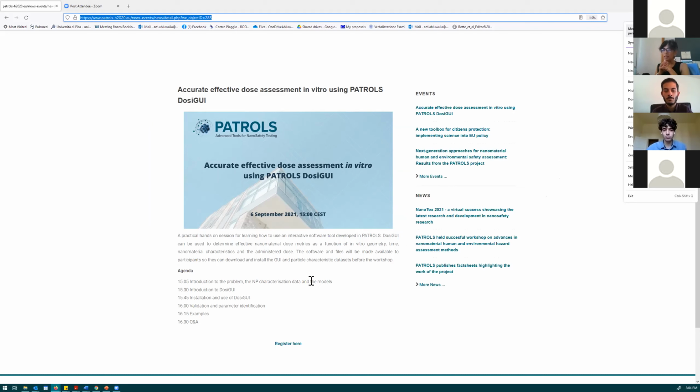We'll show you a couple of examples as we go along, and then at the end of this session, we can discuss some of the problems you might have, and also some of the improvements one might want to include in this tool. So hopefully it'll be very interactive, and if you do need to say something, ask questions, please feel free to do so. Don't feel as if you're interrupting a prepared talk, because it's supposed to be very, very informal and informative.